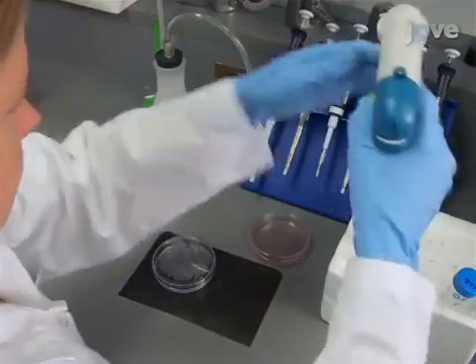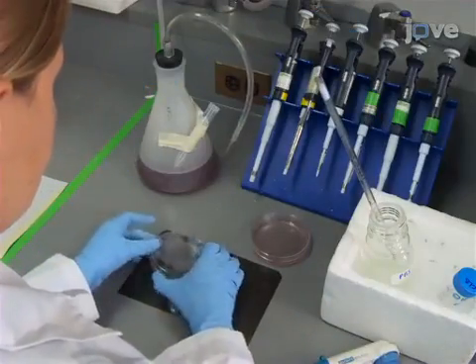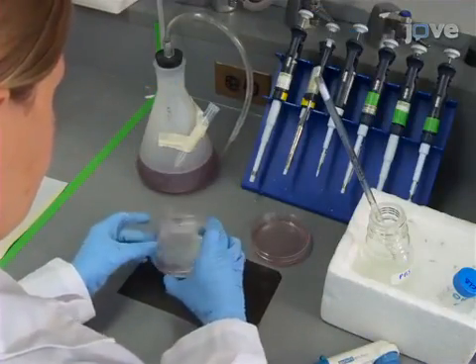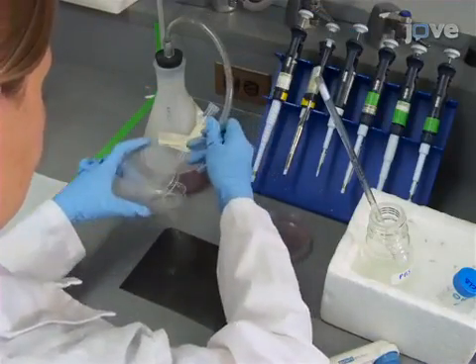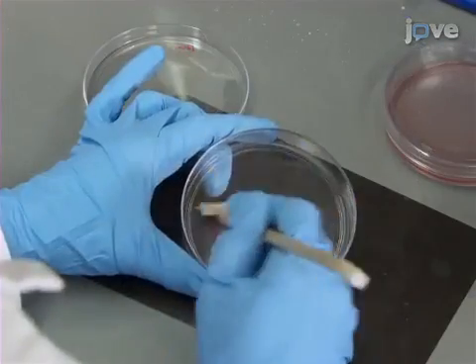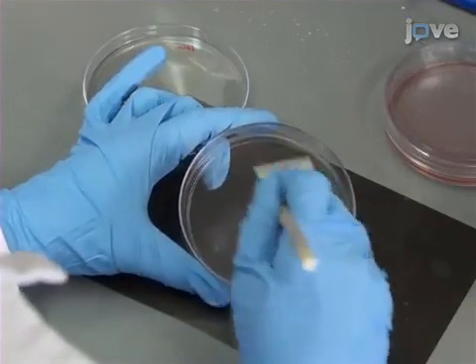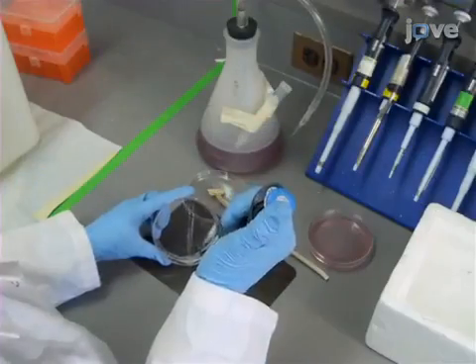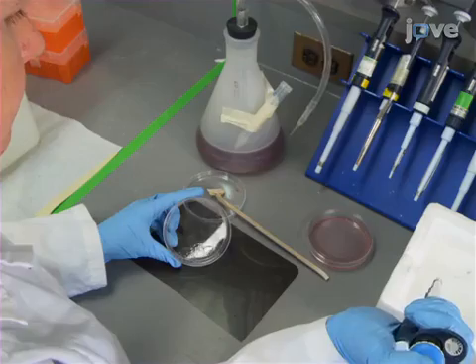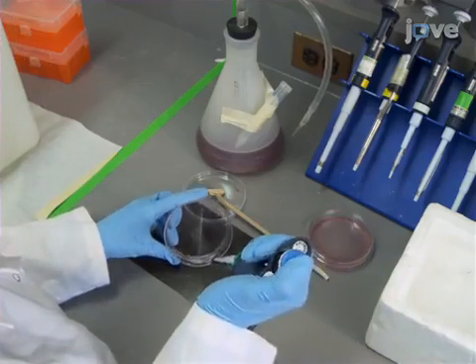For adherent cells grown in dishes, wash the cells twice with ice-cold PBS. Then add one milliliter of ice-cold PBS and harvest the cells with a plastic cell scraper. Transfer the loose cell suspension into a fresh 1.5 milliliter centrifuge tube.